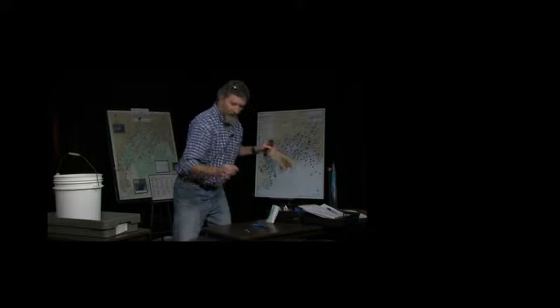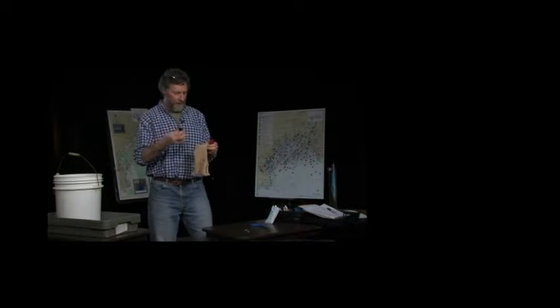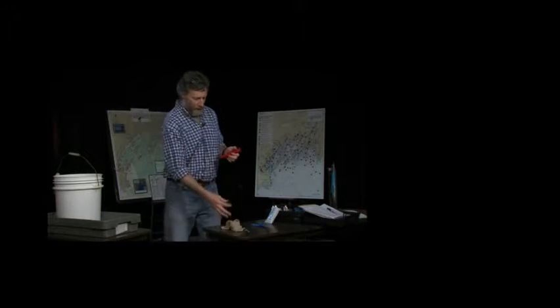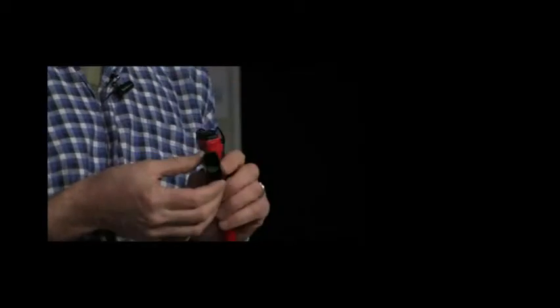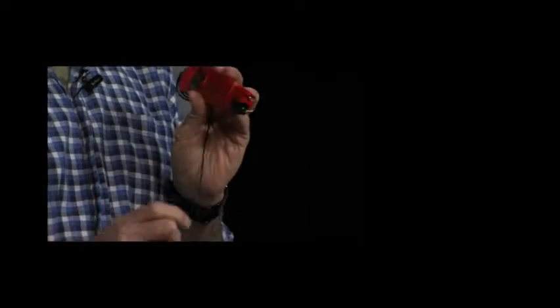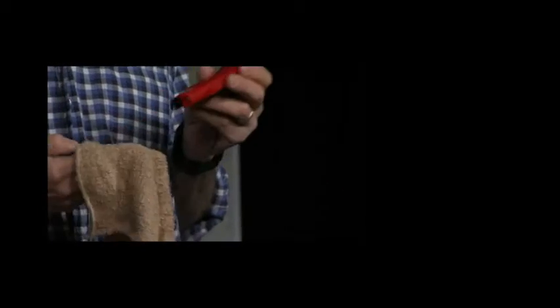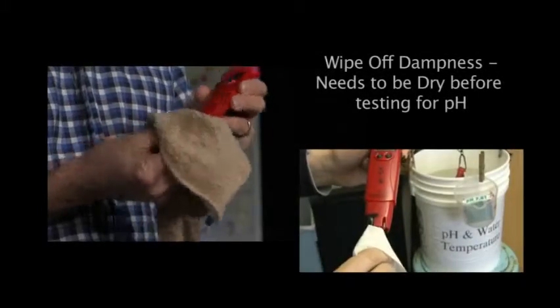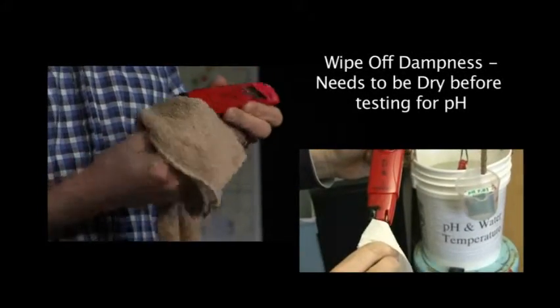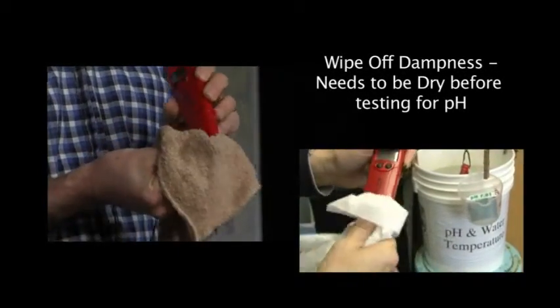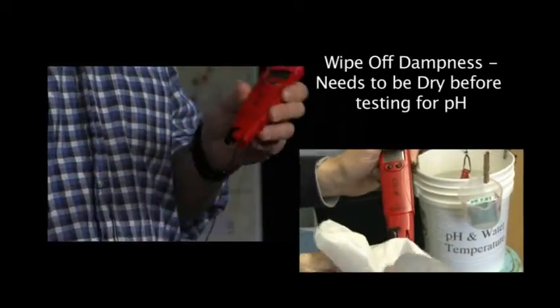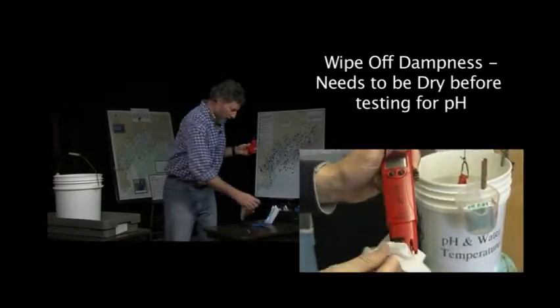The black cap that covered the probes has a small sponge inside. The idea is to keep the probe wet at all times so that it works properly. So that we don't contaminate our calibration solution, I'm going to take a little towel and wipe off whatever dampness there is on the probe.